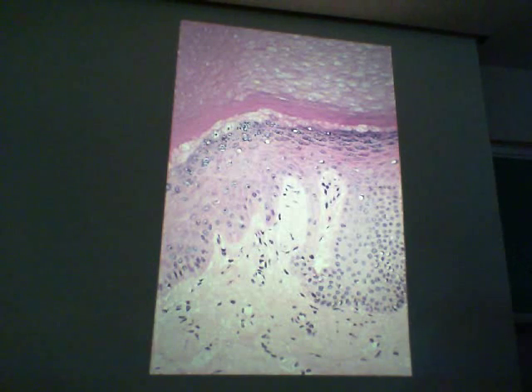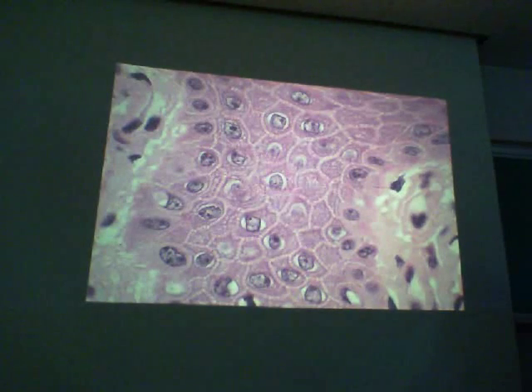And what's that thing? Meissner's corpuscle. And the layer that we see right here is what? That would be the papillary layer of the dermis, and below that would be the reticular layer. Okay, this layer right here, this is again what? Stratum spinosum. What is that structure we see right there? And there's one right there, one right there. It's a nucleus.